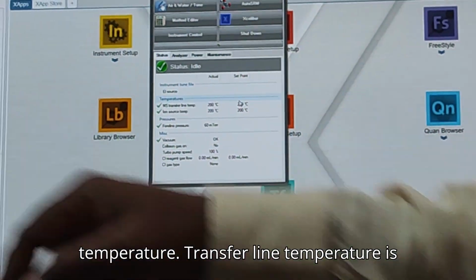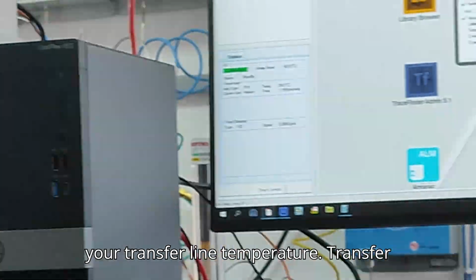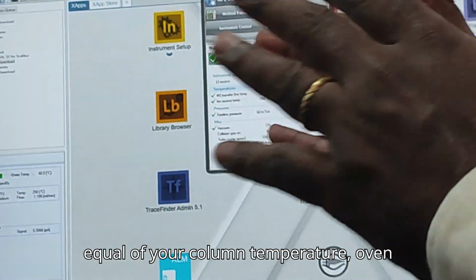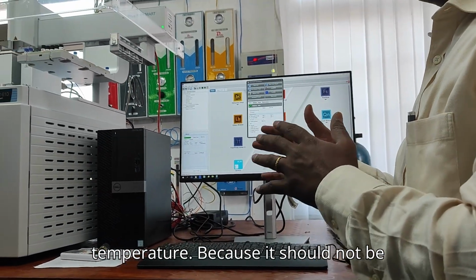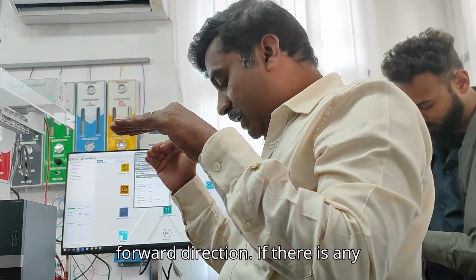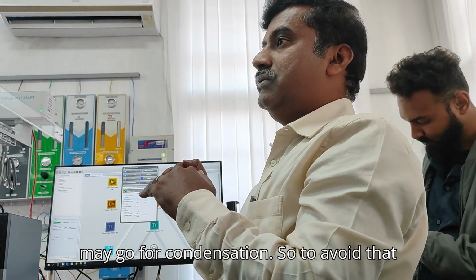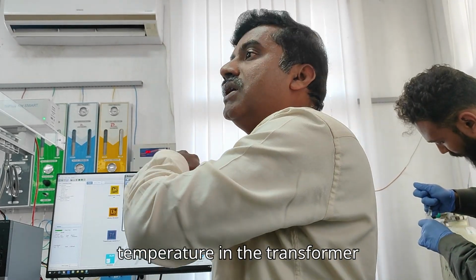Transfer line temperature is the extended length of your column. So the intermediate interface is your transfer line temperature. Transfer line temperature should always be either equal to your column oven temperature, or slightly higher than that temperature, because it should not condense. The molecular movement at the same temperature should be in a forward direction. If there is any temperature reduction, sometimes it may go for condensation. So to avoid that condensation, we always give the highest temperature in the transfer line.